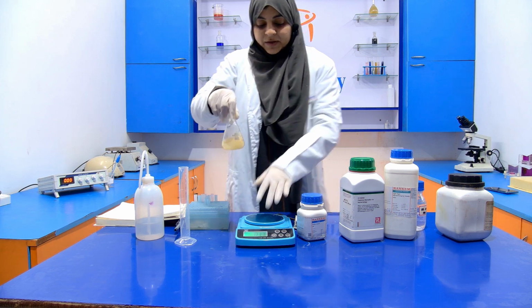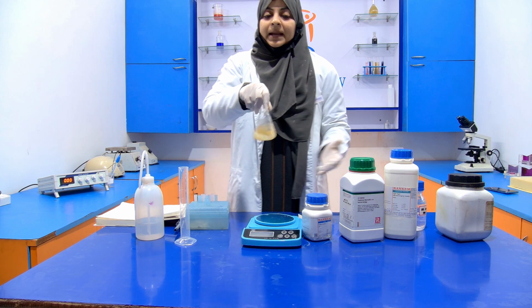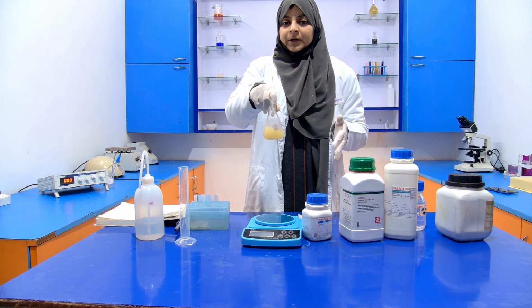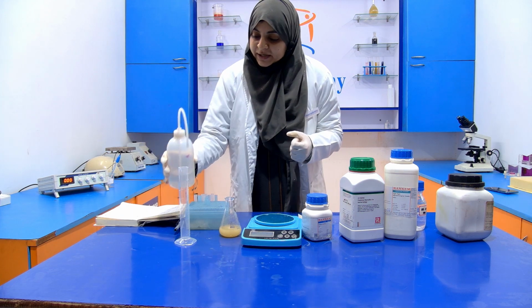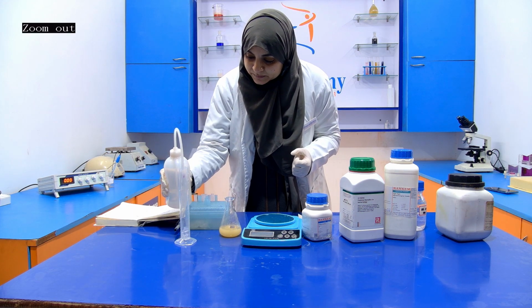Now after that we have to add the remaining 50 ml of distilled water into it. Now I am again going to measure it with the help of the measuring cylinder.